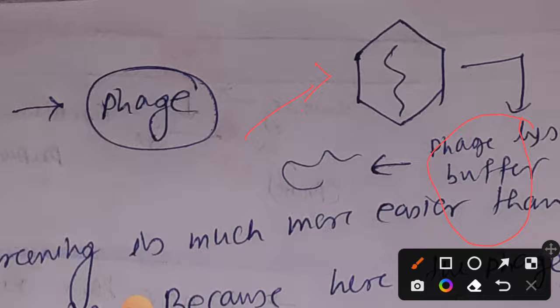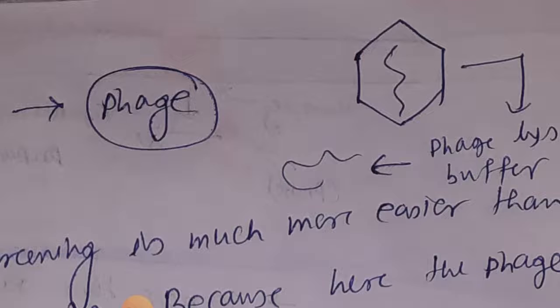And again, after the lysis step there will be a washing step, as I have discussed. The washing step will be far easier in the case of phage hybridization because it contains only nucleocapsid. So the crowd of debris will be much lower in plaque hybridization as compared to colony hybridization, because there you have to deal with ribosomes, mitochondria, cytoplasm, inclusion bodies, and cytoskeleton.